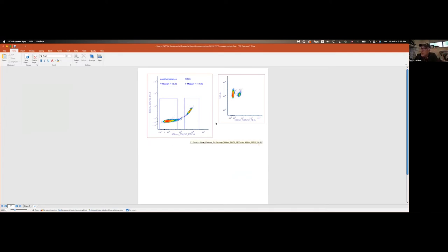We're now in the FCS Express software. We see the same data we've seen in our PowerPoint presentation. I drew gates around the negative fraction and the positive fraction. We're looking at the median on the y-axis for each population. At the end of the compensation, the value of that median for the negative population should be equal to the median of the FITC positive fraction. We're using the median because it's much better in flow to use median over mean. It's less sensitive to outliers.